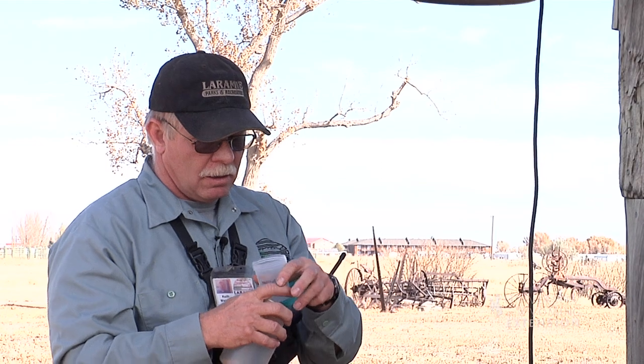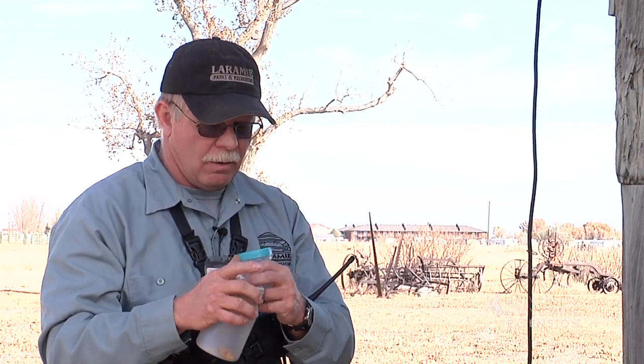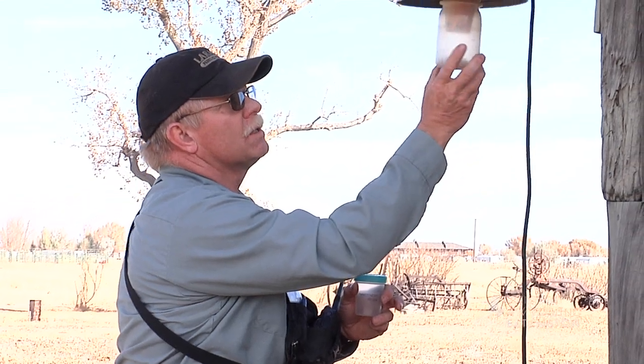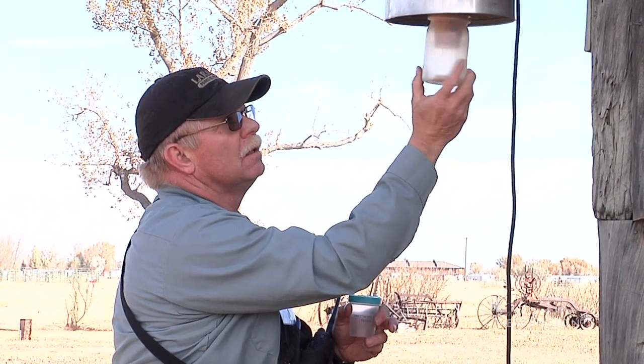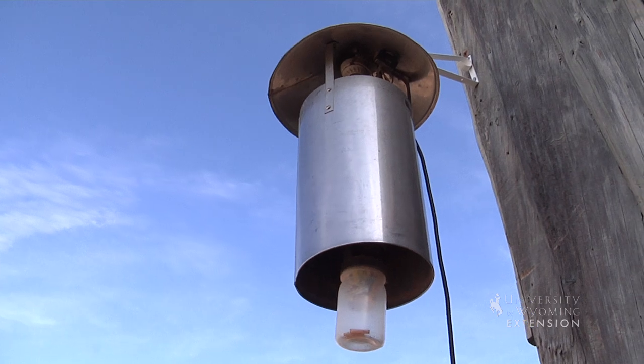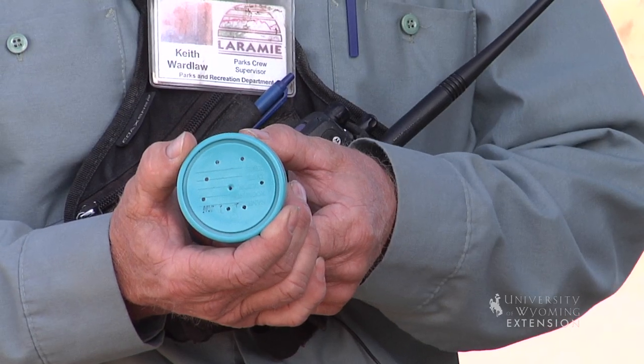Go ahead and put the lid back on so your mosquitoes don't fly away in the wind, then reset the collection cup back to the New Jersey trap — now that trap is ready to go again for tonight. With your trap contents, keep them dry and warm so that they don't condense moisture. It's also a good idea to perforate the lid on these collection cups so that they stay good and dry.